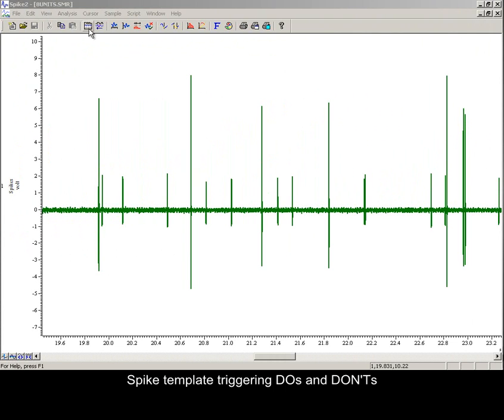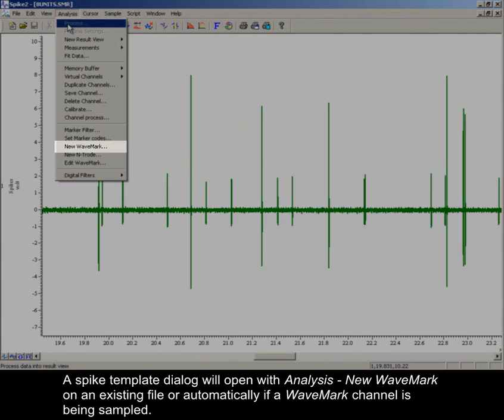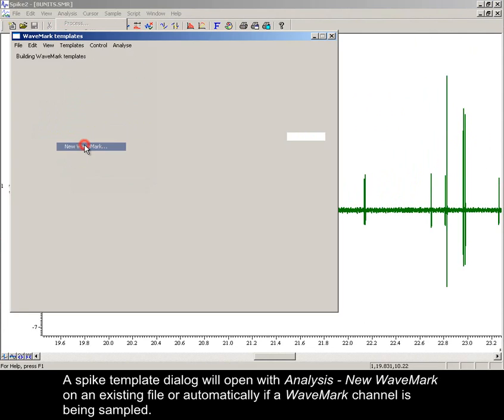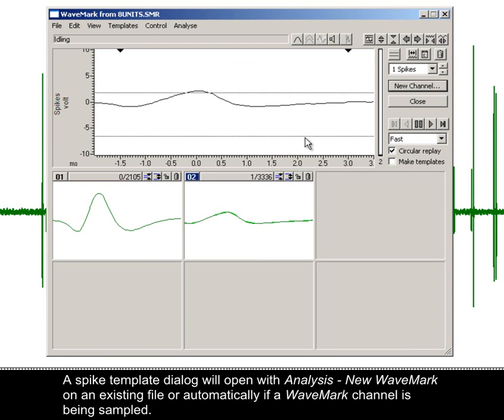Spike template triggering do's and don'ts. A spike template dialog will open with analysis, new wave mark on an existing file, or automatically if a wave mark channel is being sampled.